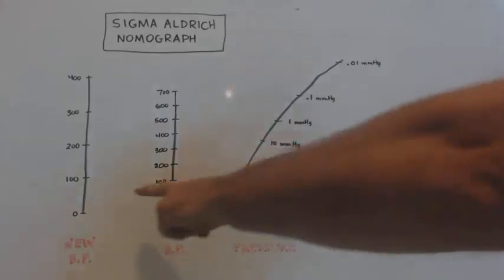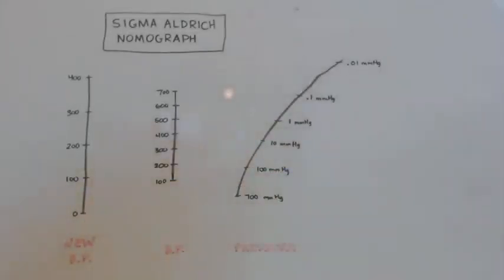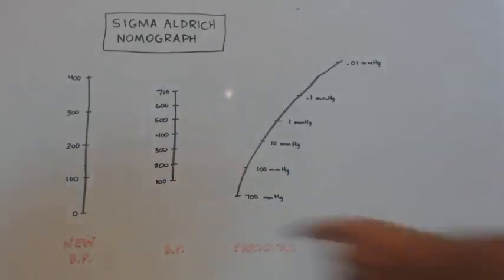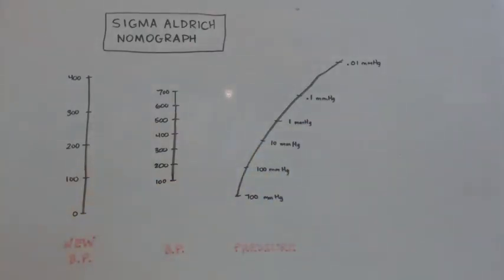I mean, like according to this, let's say that it was boiling at 0 degrees Celsius, and it normally boils at 100. You draw your line. We already saw that it went to 10 millimeters of mercury. Now that isn't right, because I didn't print this out. I just drew this by hand. But if you were on a computer, you'd know exactly what your pressure was on your vacuum gauge, right?